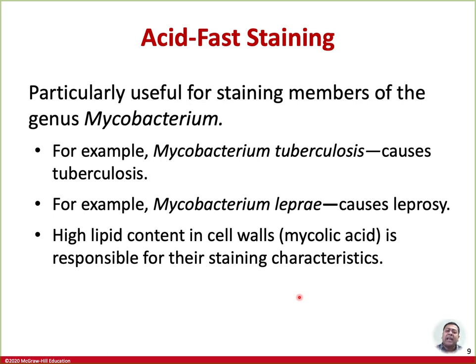These bacteria have a very high lipid content in their cell wall, and they contain a particular type of lipid known as mycolic acid. These are a group of branch-chain hydroxy fatty acids, and they are one of the main components of their lipidy cell wall. This prevents the dyes from readily binding to the cell. So to do that, we have to do a specific procedure.